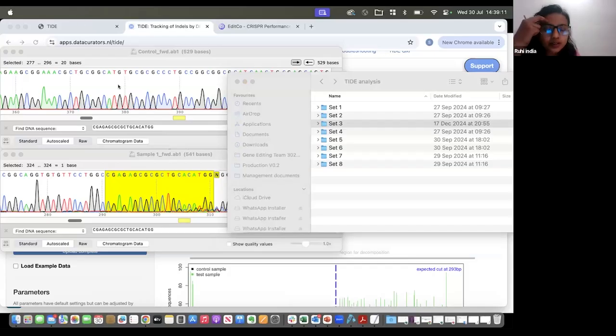May I ask you one thing? Do we have to open SnapGene and tie them together?